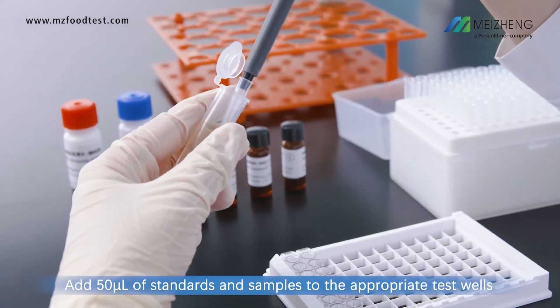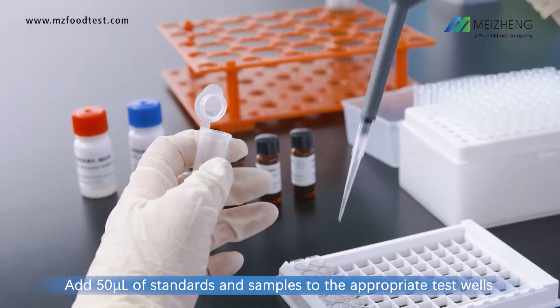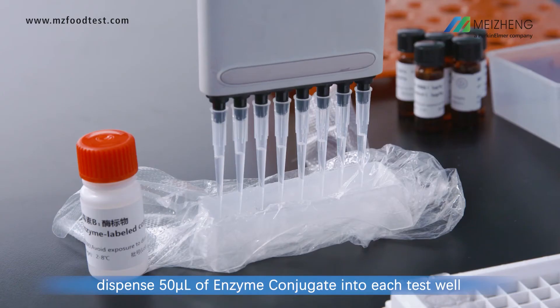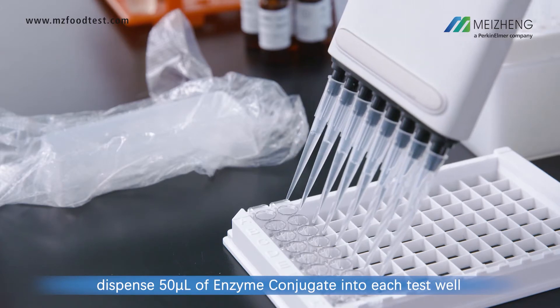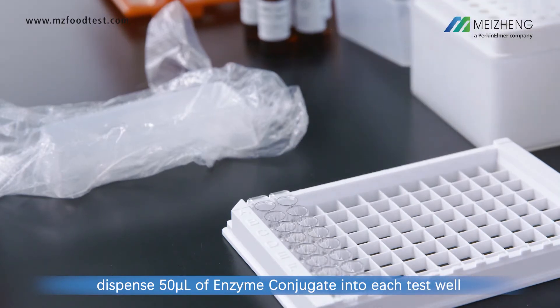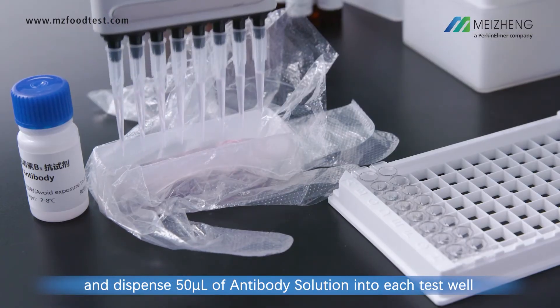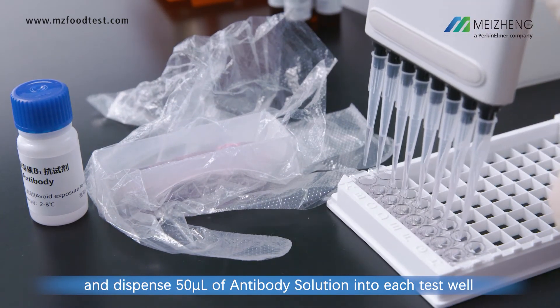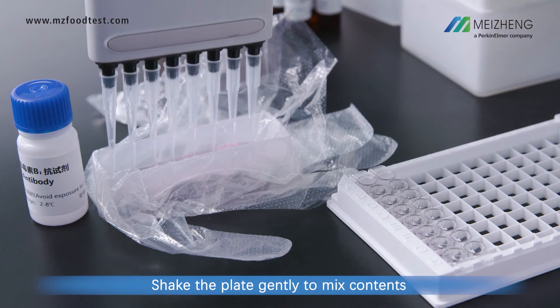Add 50 microliters of standards and samples to the appropriate test wells. Dispense 50 microliters of enzyme conjugate into each test well, and dispense 50 microliters of antibody solution into each test well. Shake the plate gently to mix contents.